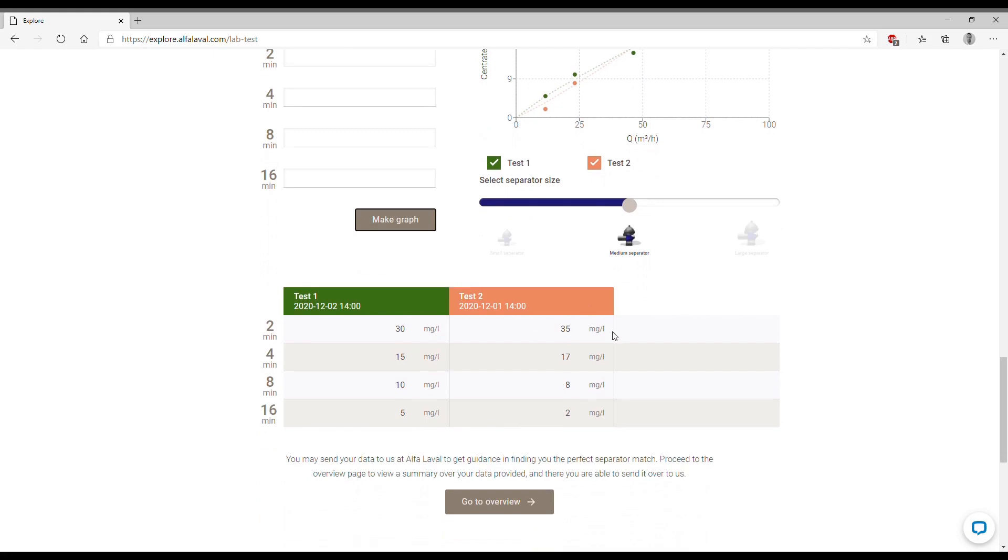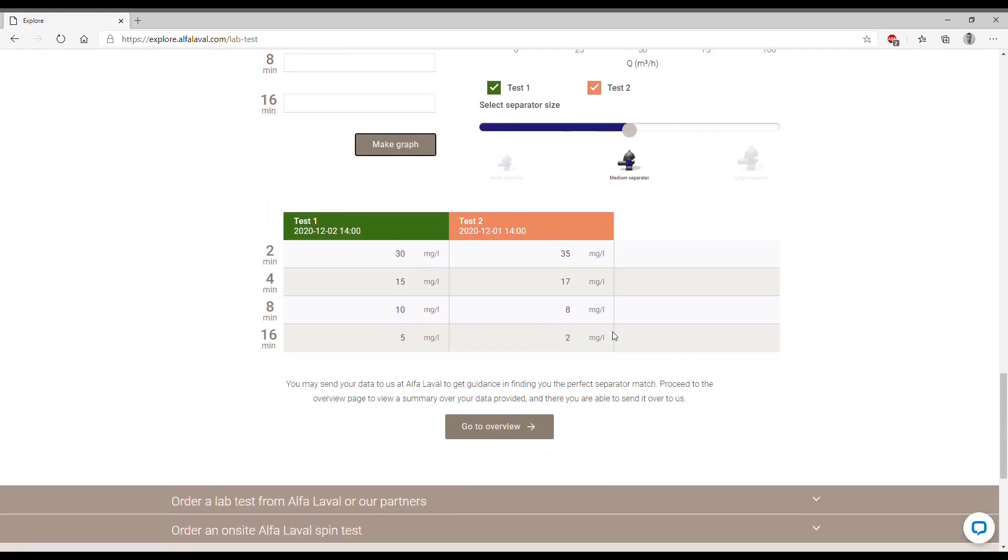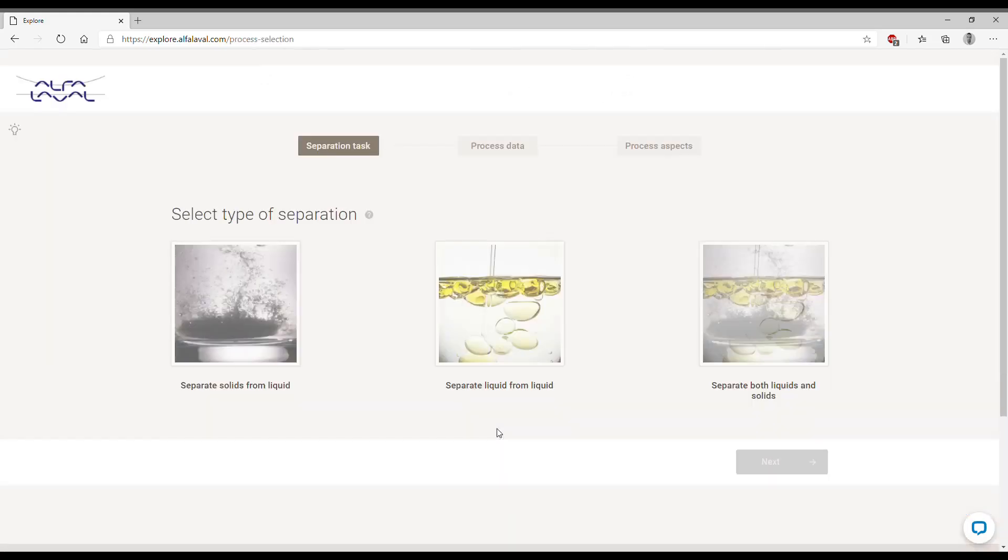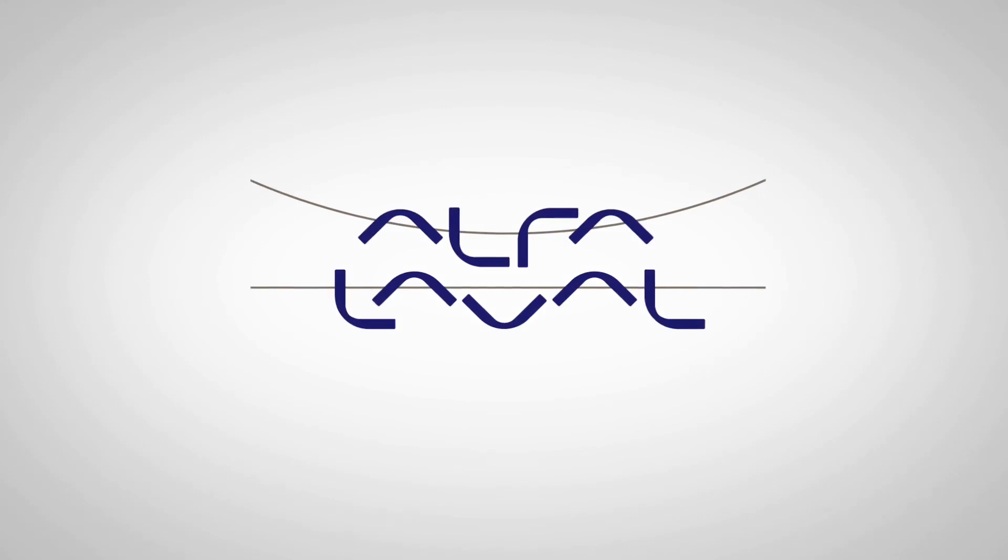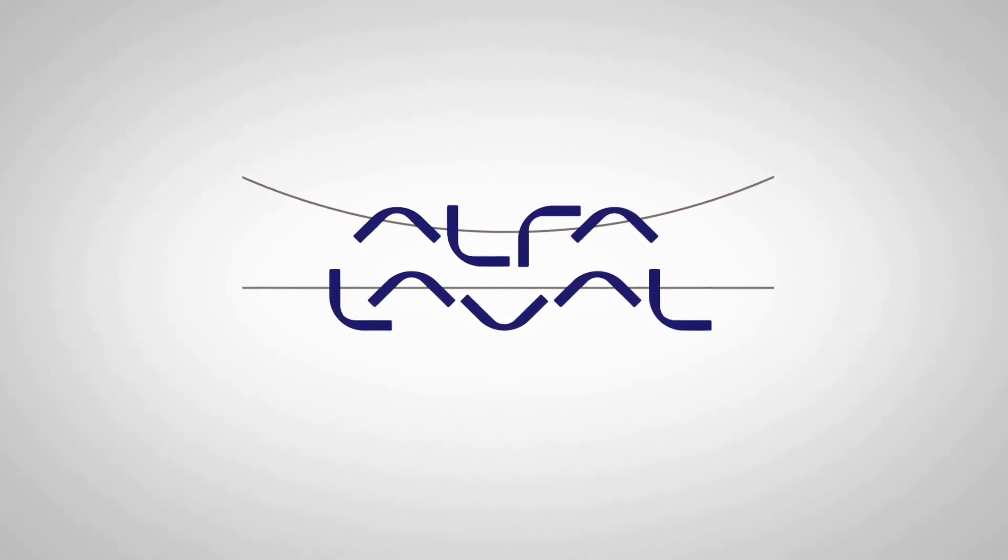Once we concluded all our simulations we can click on go to overview. We now reached the first page of the explore simulation tool. Please refer to the other video describing how to use this simulator and how to send the results to Alfa Laval for review. Once you do that we can start the dialogue on how to solve your separation case. Okay this is all for this video, thank you very much for your attention.